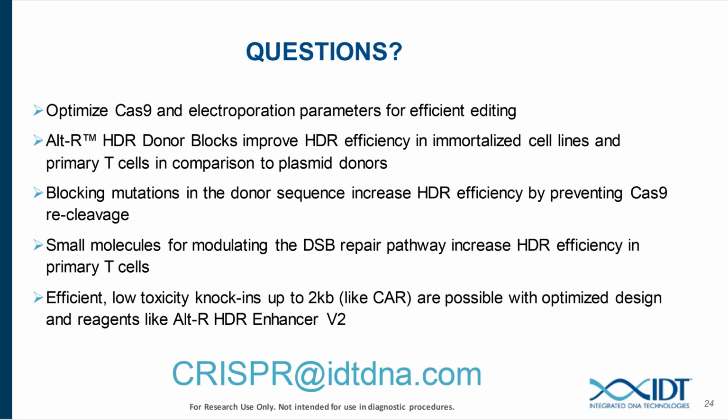Thank you, Bernice, for your very informative presentation. We received several questions from our audience. First question is, why do you see differences in editing between different primary T cell donors?